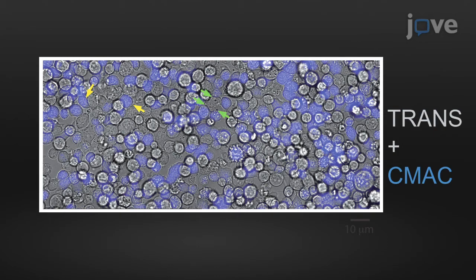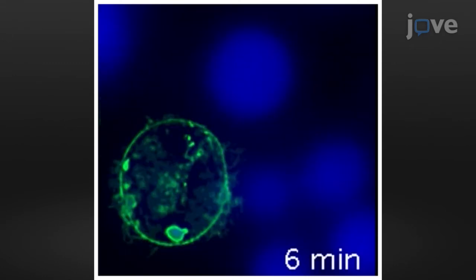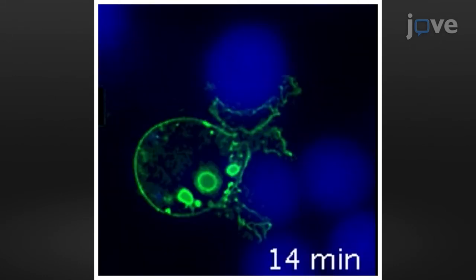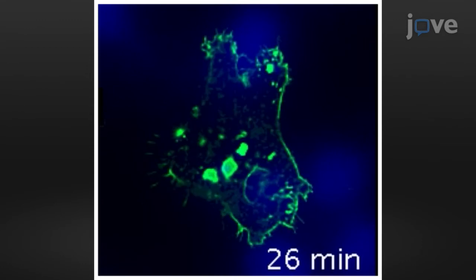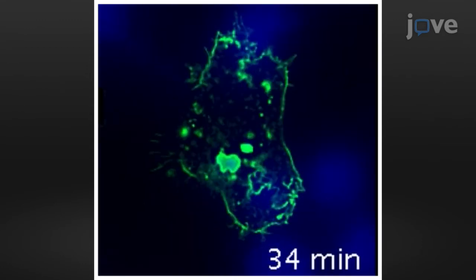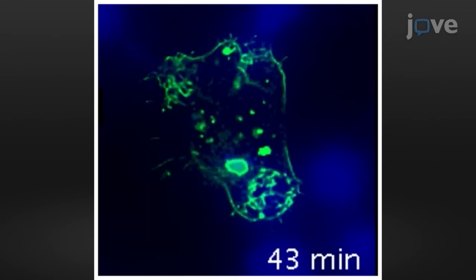A deconvolution of the GFP CD63 fluorescence channel images is performed with an appropriate deconvolution software using the wide field optical option and the proper optical parameters. This deconvoluted channel was subsequently merged to the cell tracker blue raw channel. There is an improvement of both the signal-to-noise ratio and the sharpness.